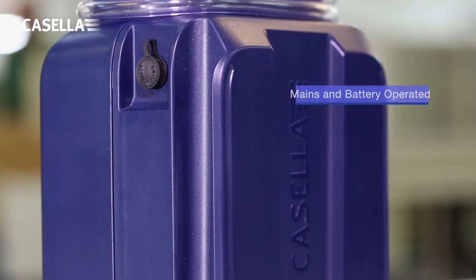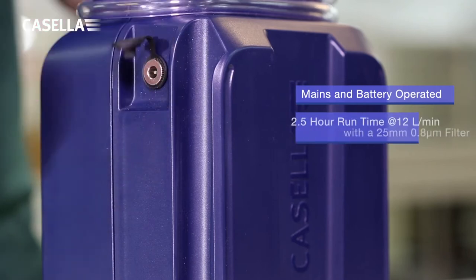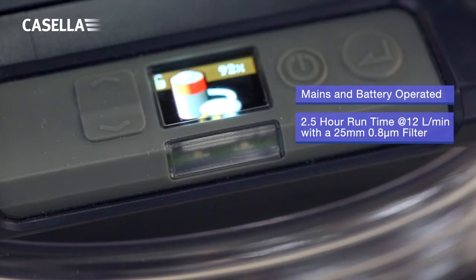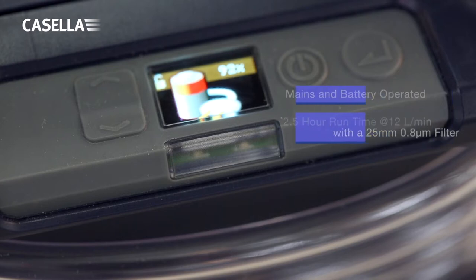Each pump can be either mains or battery powered, providing hours of uninterrupted operation. The battery can be fully recharged in under 6 hours.